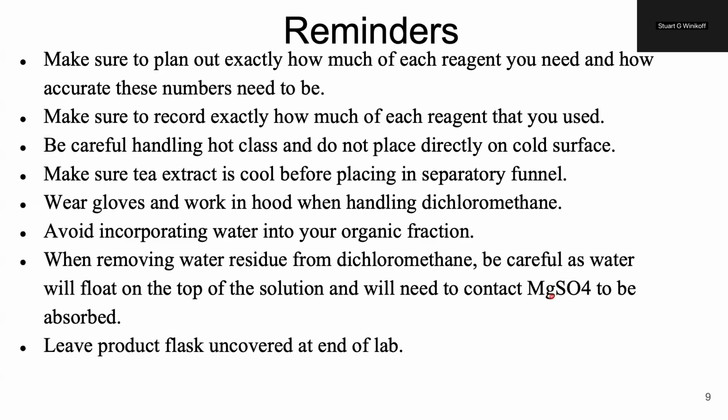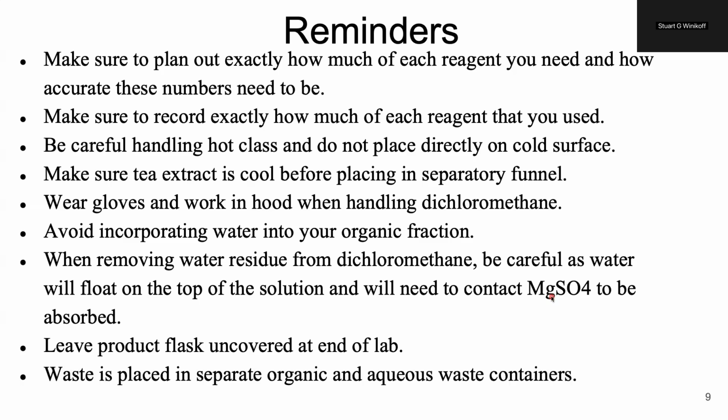Then again, at the end of the lab, do make sure that product flask is uncovered because we need that last remaining dichloromethane to evaporate by next week. And again, make sure it's not in your drawer, as the remaining residue can cause issues, and you want it in the well-ventilated hood instead.